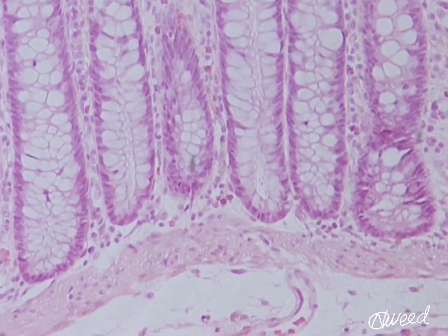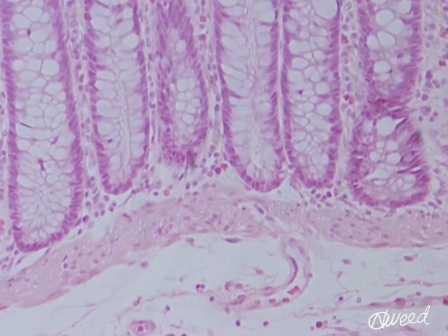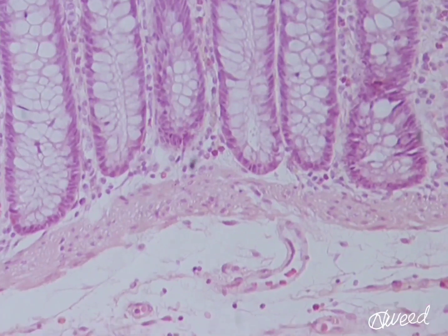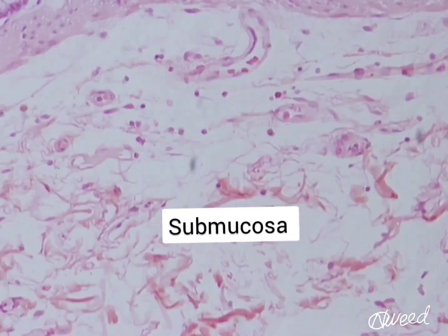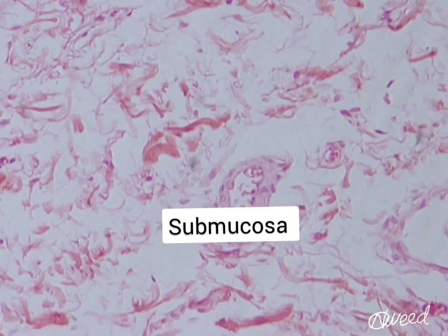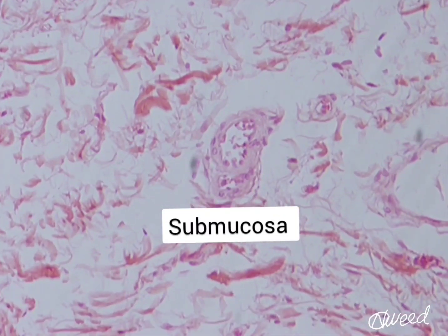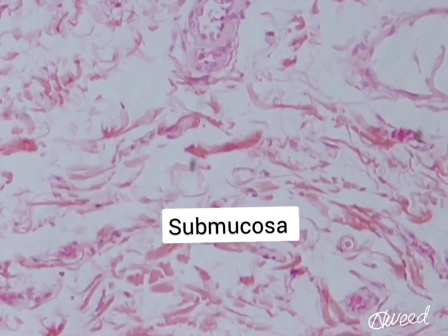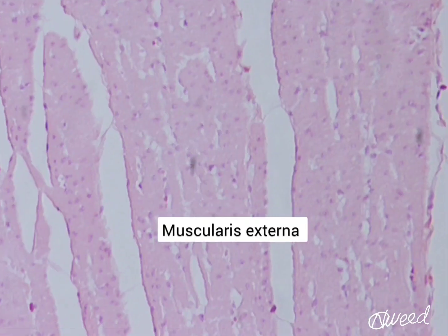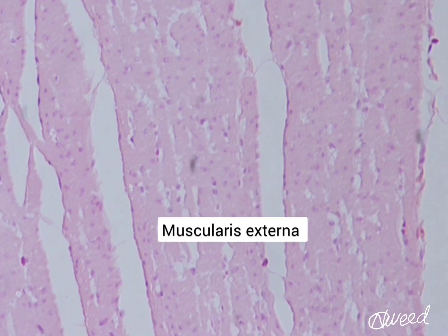The submucosa consists of dense connective tissue, which contains blood vessels, lymphatics, and nerves. The muscularis externa also consists of inner circular and outer longitudinal layers of smooth muscles.